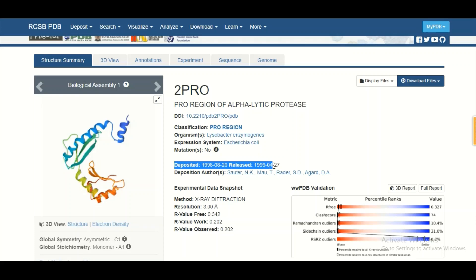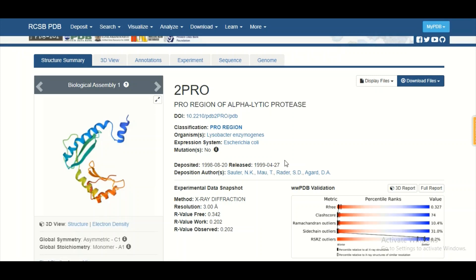At the bottom, you can see the deposit date and the release date of your protein structure. This structure was deposited to the Protein Data Bank in 1998 and released in 1999. The deposit date is when the author submitted the protein structure to the authorities of the Protein Data Bank, and the release date is after the authorities evaluated the structure and found no discrepancies.